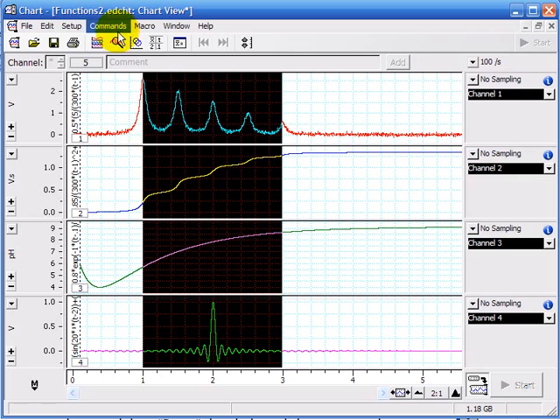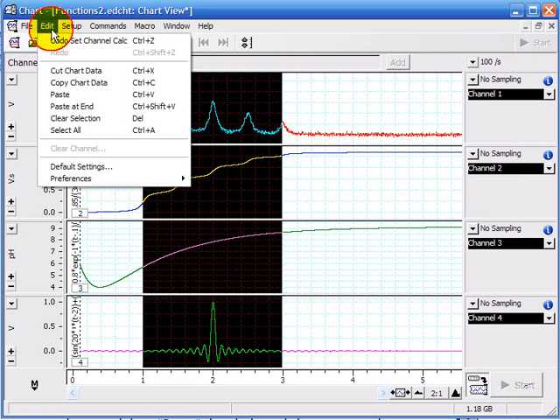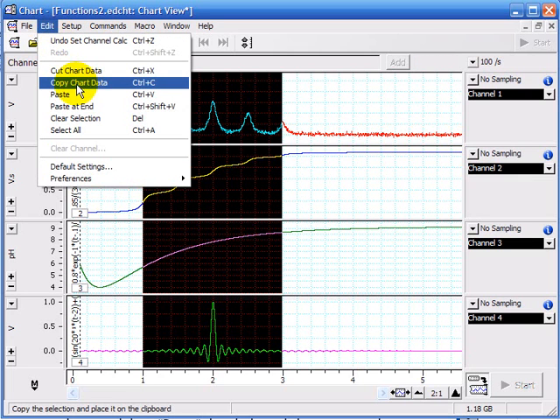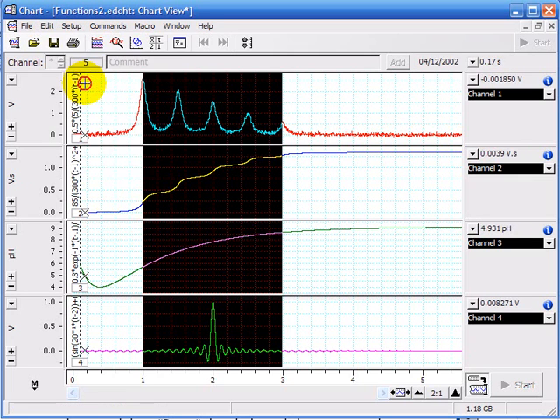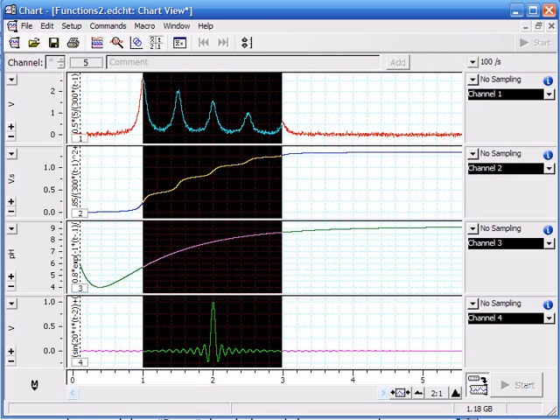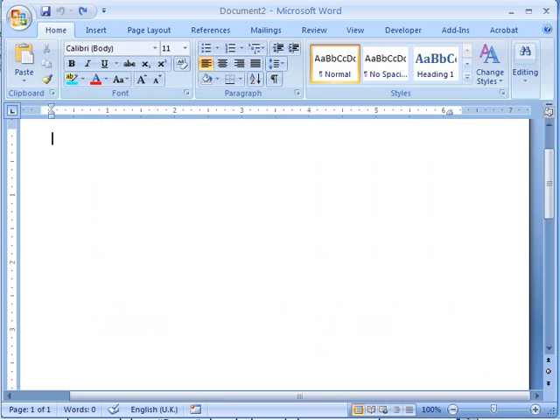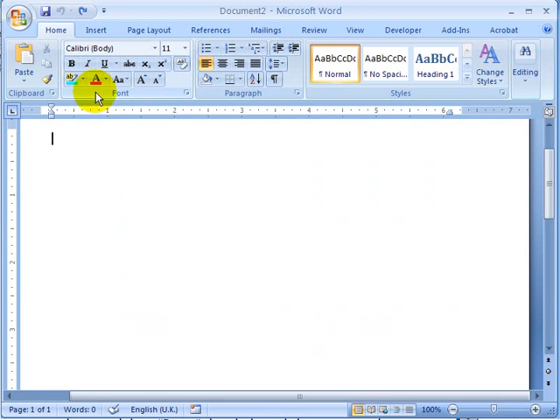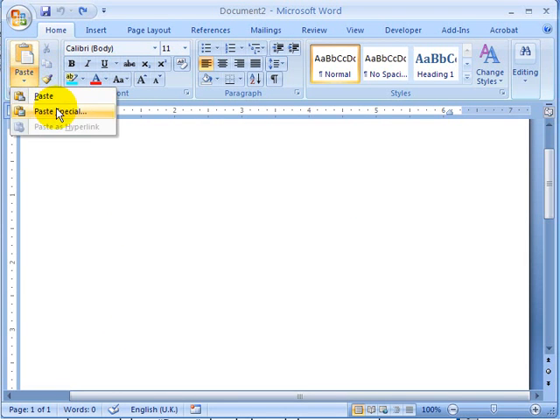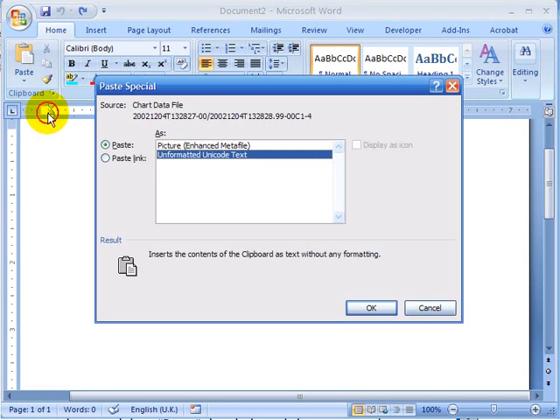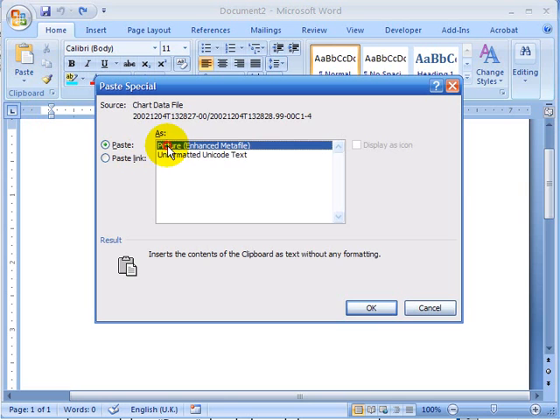You make a selection the same way, in edit you do the same thing, copy. You open up, for this example I'm going to open Word, and instead of pasting you want to do a paste special where you want to copy as a picture.